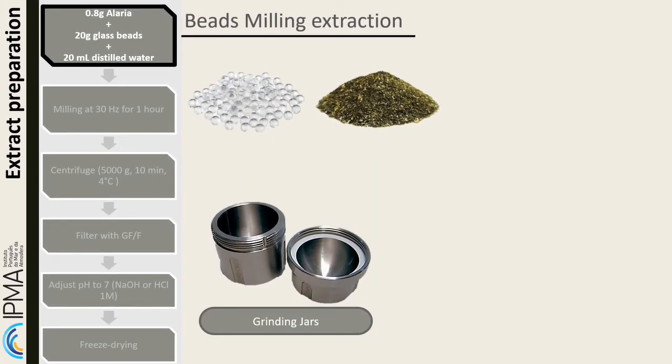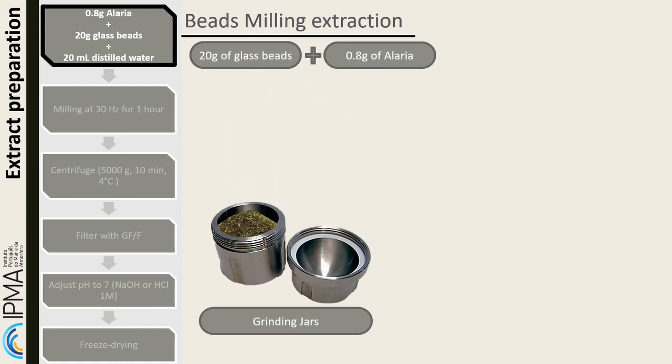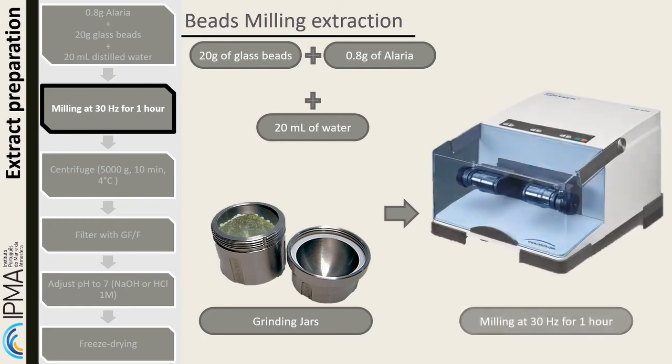For the bead mill extraction, add to each mill capsule 20 grams of glass beads and 800 milligrams of dried Alaria. Add 20 milliliters of water. Start the mill at 30 Hz for 1 hour.